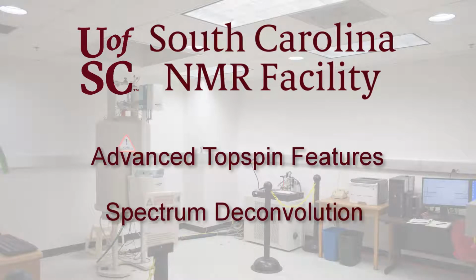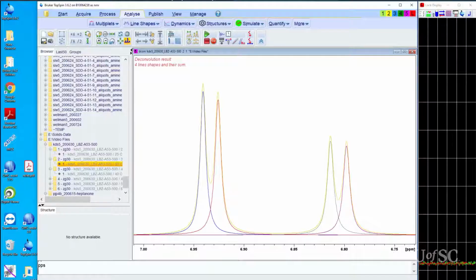In this video we will demonstrate the peak deconvolution function of Topspin. Spectrum deconvolution is a mathematical method used to simulate a region of a spectrum to give details of chemical shifts, line widths and integral intensities. The algorithm is robust enough to be able to separate peaks that have significant overlap.